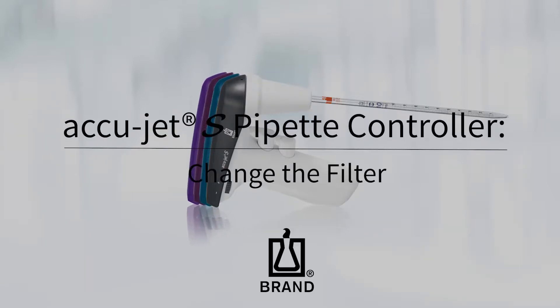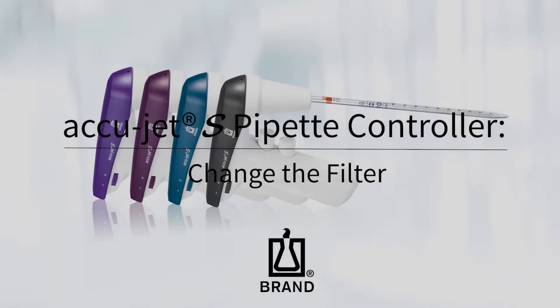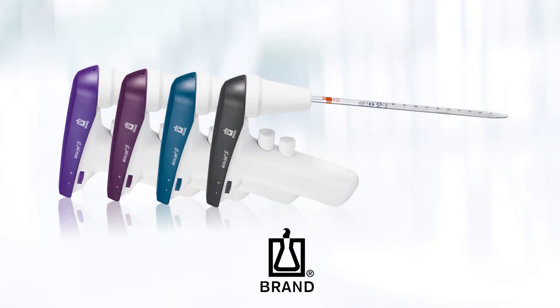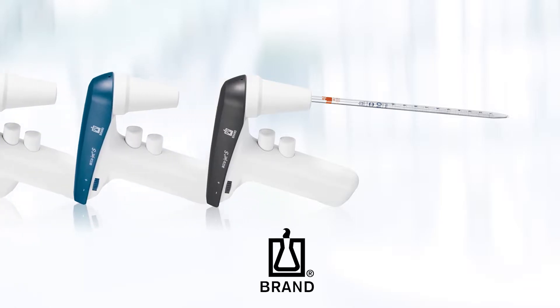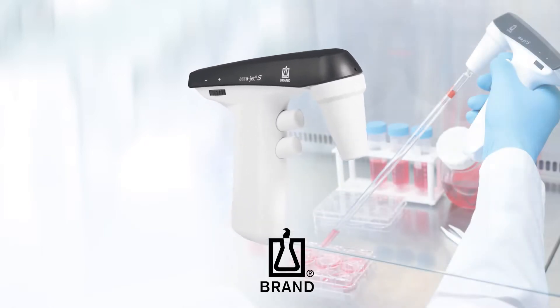The new AccuJet S Pipette Controller from Brandt gives you an ideal combination of precision and power. In this video, we'll show you how to replace the filter in your AccuJet S. Replacing the filter is necessary if the pipette was overfilled or if the suction capacity of the AccuJet S is impaired.